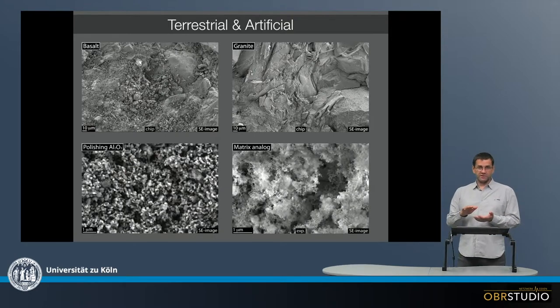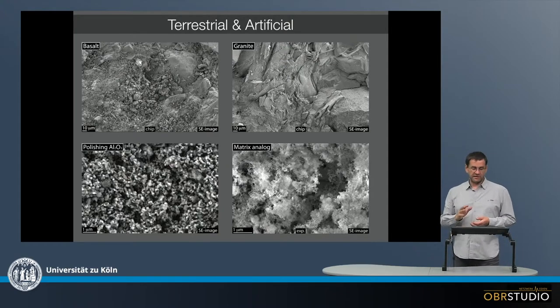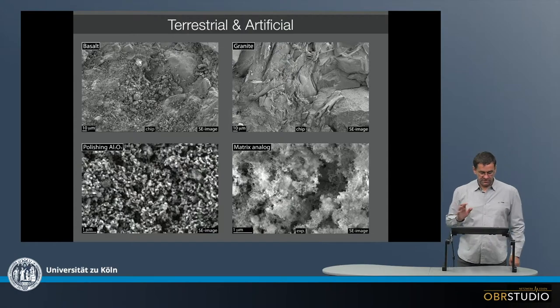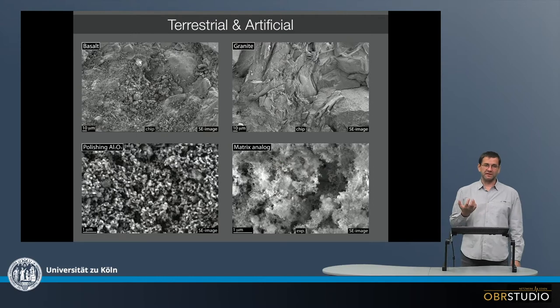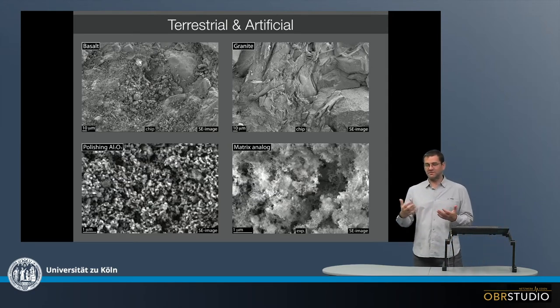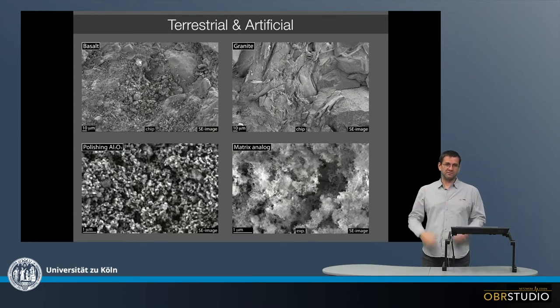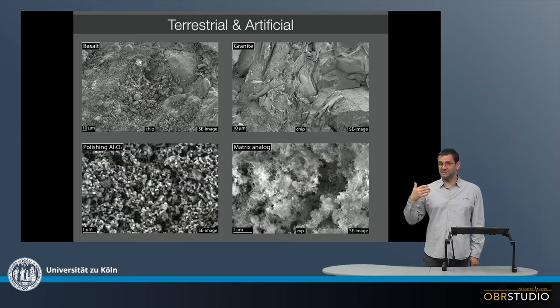Also, thin sections are polished with aluminum oxide, which is down here. So if you see this structure, it might be aluminum oxide, so you also need to be careful here. And this is a matrix analog, this is an experimental ash sample or something like this, but this experiment doesn't look too much like matrix does. So this is a very brief introduction to matrix, because as I say it's difficult, it's very nice to image and have a look at it, but quantification is difficult. Still this gives at least some impression how the matrix in chondrites looks like.